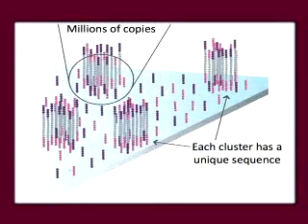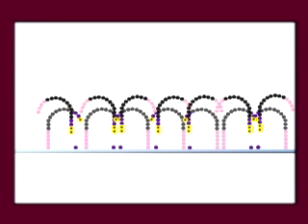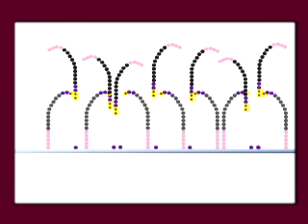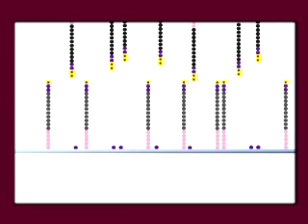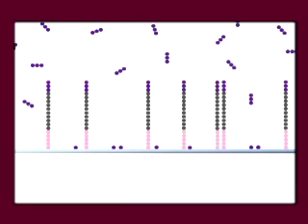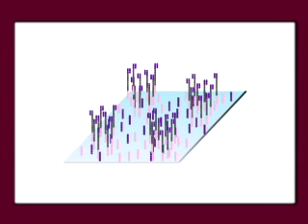The amount of reagents we use is greatly decreased, and we end up with millions of clusters of DNA, each cluster having a particular sequence. Now, one of the strands is cleaved within the adapter sequence, and the reaction is heated to separate the strands. Because one strand is not attached to the flow cell, it floats away. Now, each cluster contains only single-stranded DNA of a given sequence. The sequencing primer is added, it hybridizes to the corresponding adapter sequence, and the clusters are ready for sequencing.